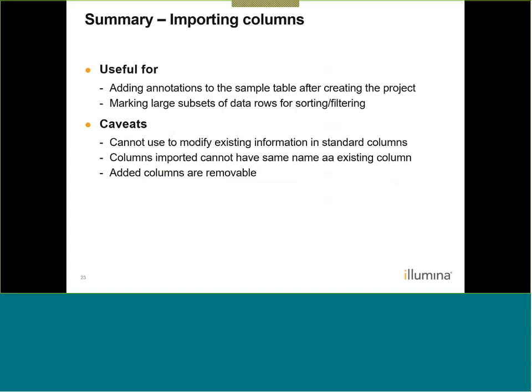A few caveats. Number one, you cannot use the import column to modify existing information in standard columns. So you cannot modify the standard columns that are already part of the GenomeStudio table. You can only add columns to the existing columns. Columns imported cannot have the same name as an existing column. And finally, added columns are removable. In any column that you've added, you can right-click at the header, and the option to remove the column will show.